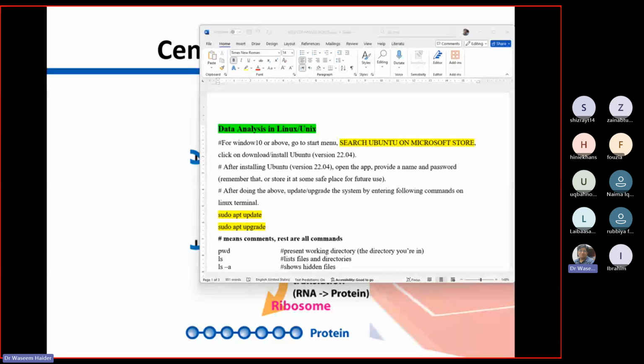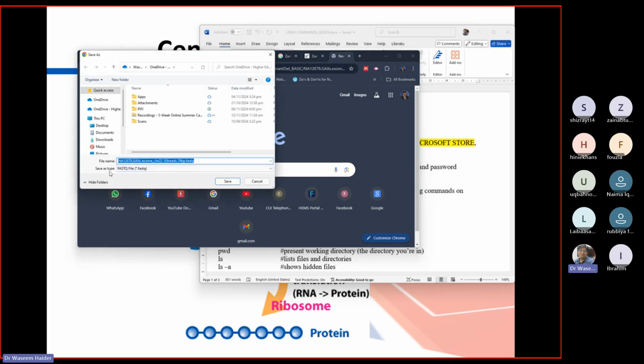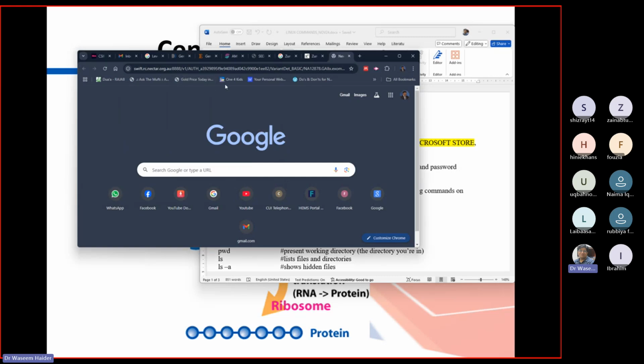I'm wondering where that link is gone. So yeah, I just copy and paste it here. All right, so what it does was I just enter. So yeah, he's giving me this option. So basically it's a link that automatically downloads this short read data that contains the short reads from some chromosome of some individuals.